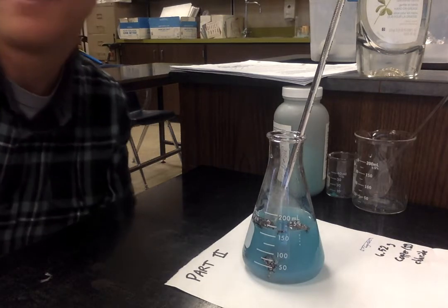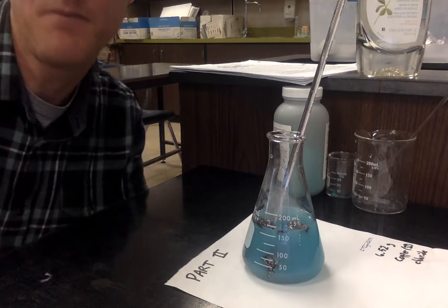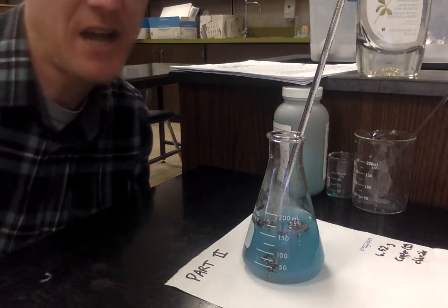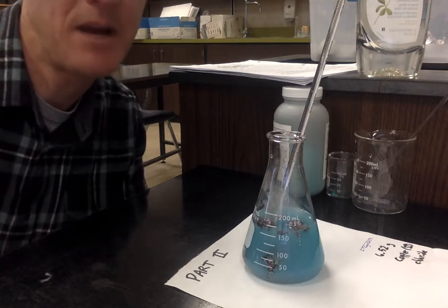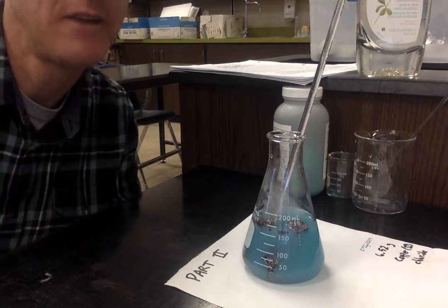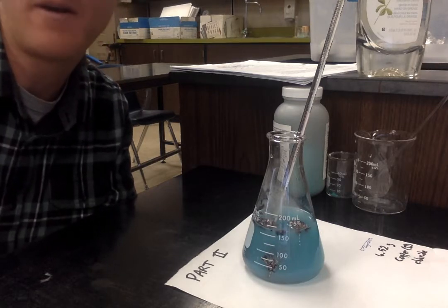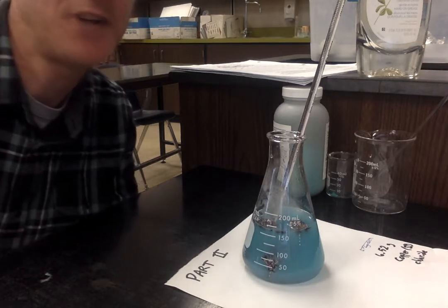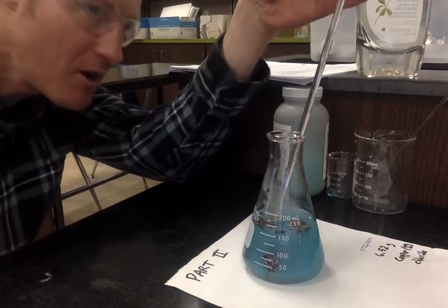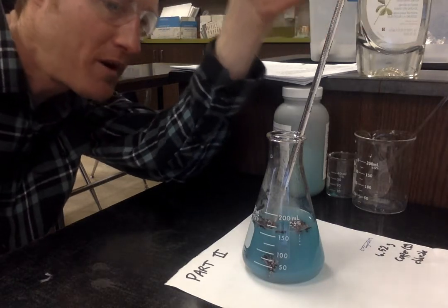You could even guess yourself how long that took based on the timestamp on the video, and when the bubbles started coming up in the solution. As soon as the bubbles started coming up in the solution, they had gone past a level that the graduated cylinder could fill. So you should actually be able to tell me exactly how long it took for the 65 milliliter graduated cylinder to fill with gas. The temperature of this reaction with copper chloride is 30.5 degrees.